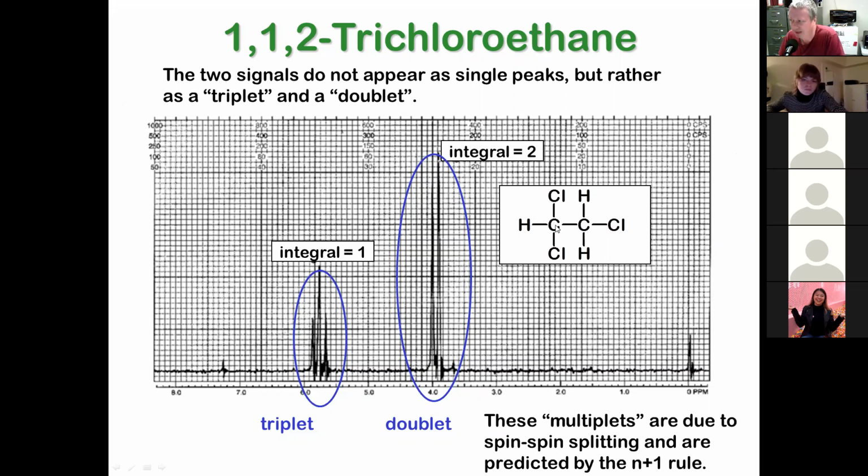And it's probably the CH, right? Why is the CH downfield? Because it's got 2 chlorines, right? And it's coming pretty far downfield. It's like 6 ppm almost, right? Okay, and of course the integrations make sense. One's a CH, one's a CH2. Oh, that all makes sense. Well, what's the thing that doesn't make sense? The multiplets. And this is going to be really cool, all right?